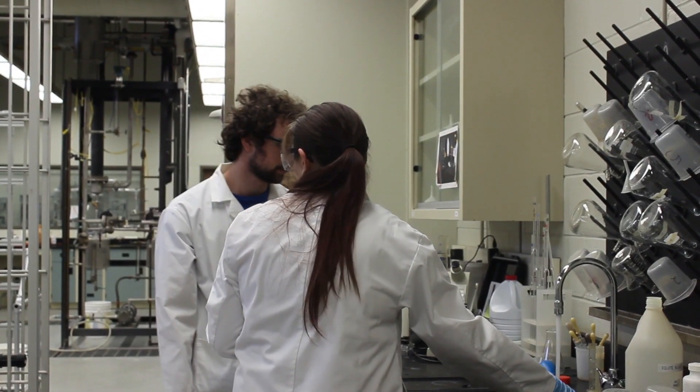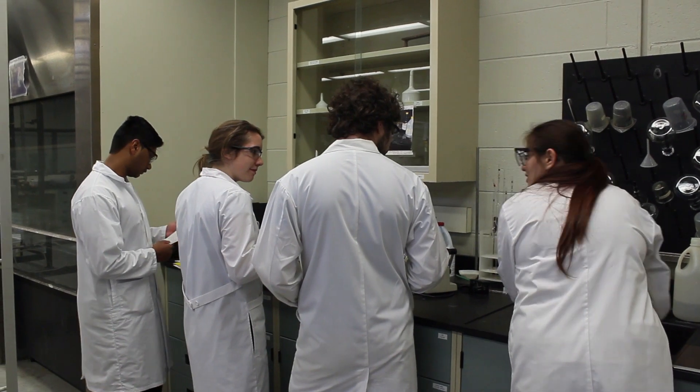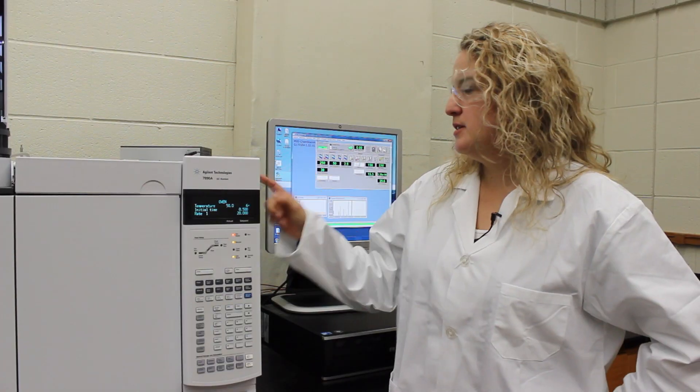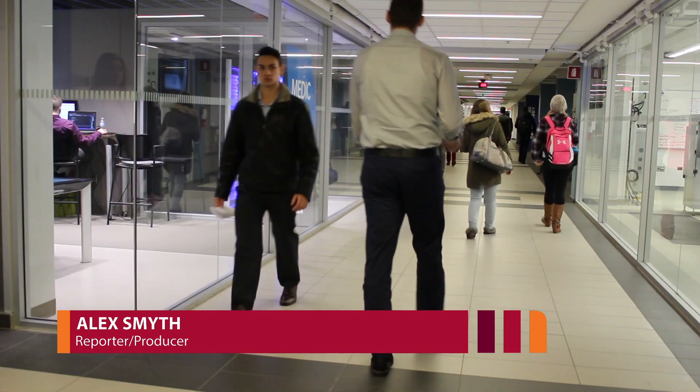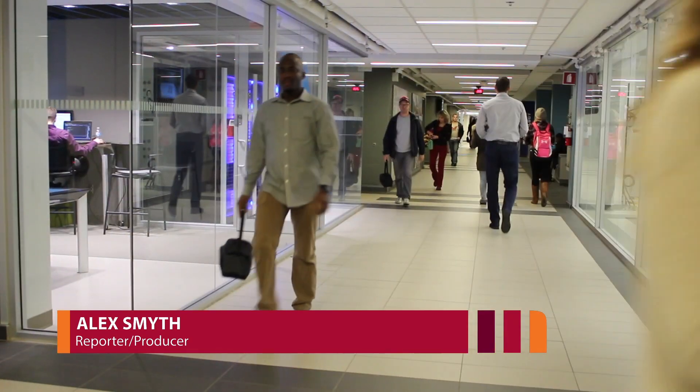The students of this program are getting a unique opportunity to work on equipment that is found in the industry. To be perfectly honest, this is even better than what they're using in industry—this is the best instrument in this lab. It's a lot more technical than you actually see in industry, so it's nice to be able to work on something like this and then go out and see how lucky you are.